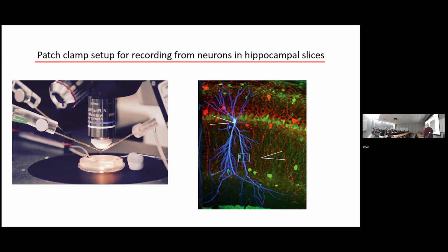And we're going to then image a very small part of the dendritic field with a high resolution camera to tell us what's going on in the spines, which you can't see in this figure, but which will blow up and you'll see in the next figures.